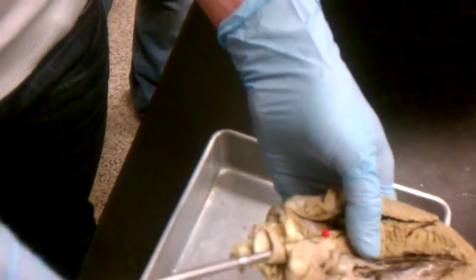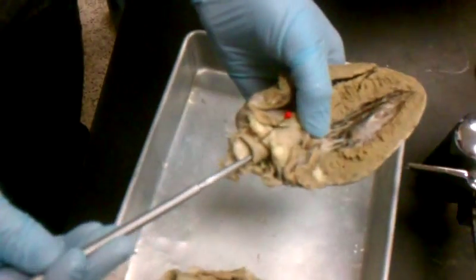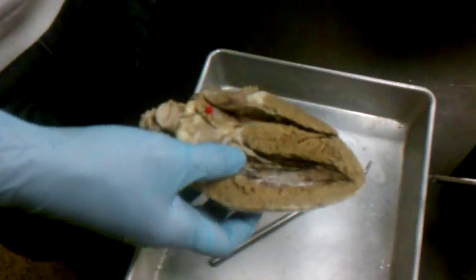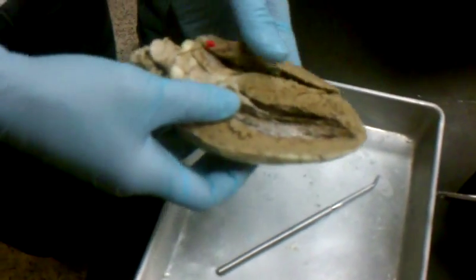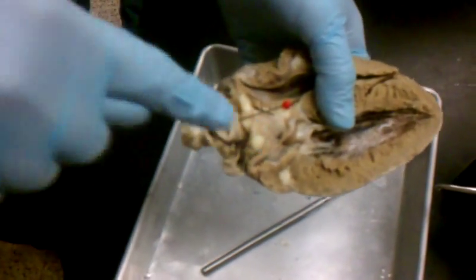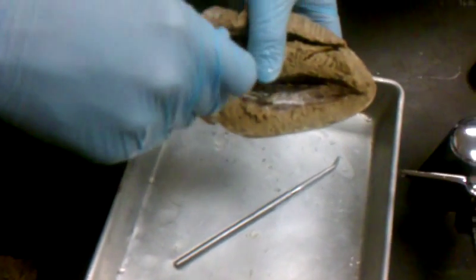This thing right here, this big old hunker. Aortic? Yep, it's the aorta. You can also ask that on the cat. It's the aorta, it's an artery. You see it on top of the heart. Usually it crosses over the heart, it kind of curves. So that's the aorta.